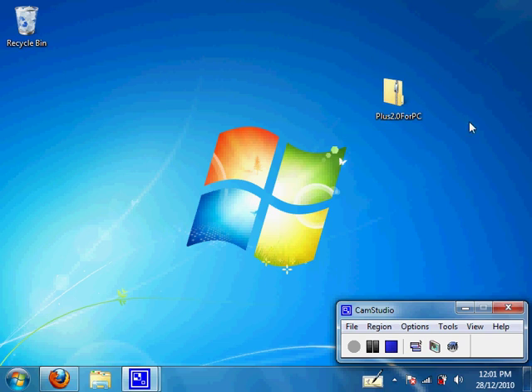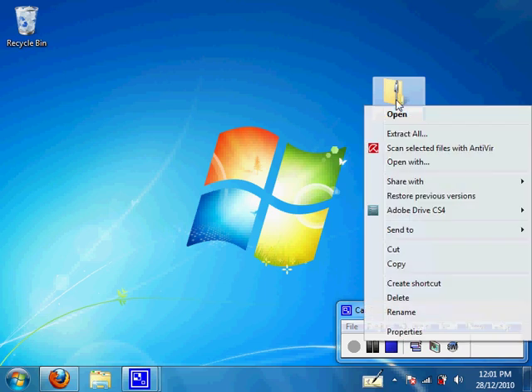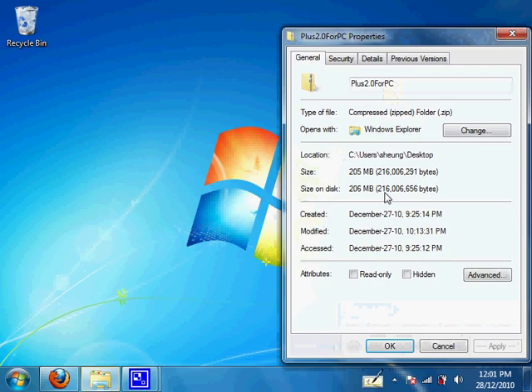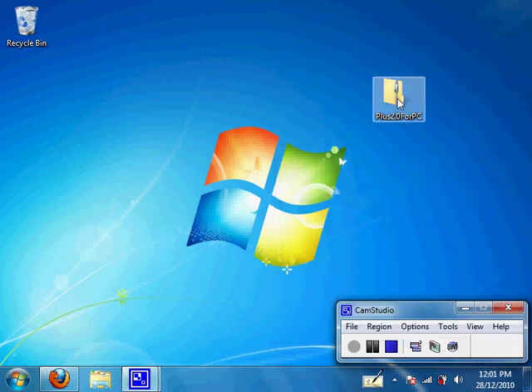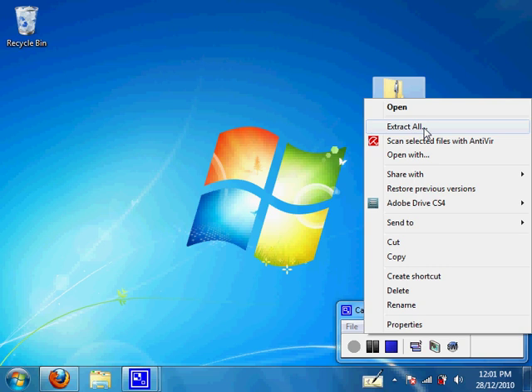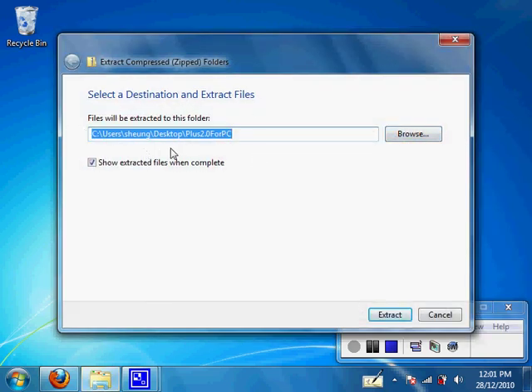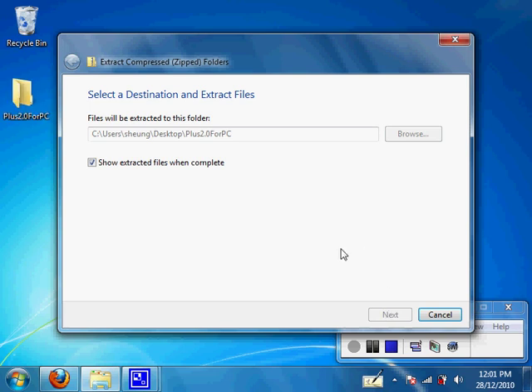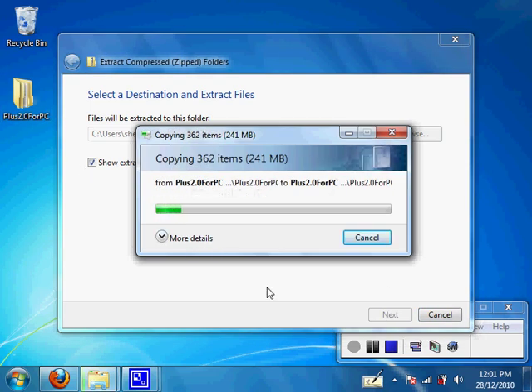As you can see, it's downloaded onto my desktop: Plus 2.0 for PC. Let's check the size by right-clicking on the zip file and going to Properties — as you can see, 206MB, so we know for sure we got the whole file. Next, right-click on the zip file again and click Extract All. If the prompt says extract to the desktop, everything is great — just click Extract and it will make its own folder.